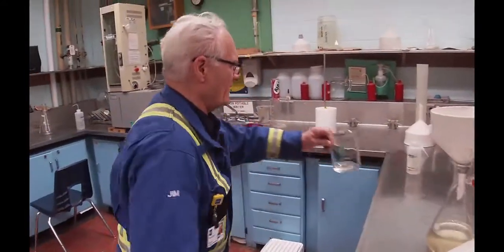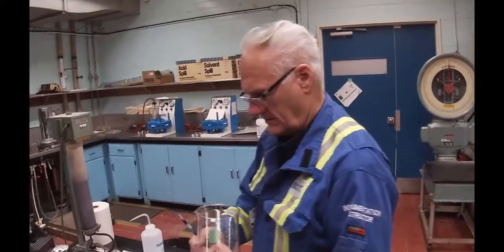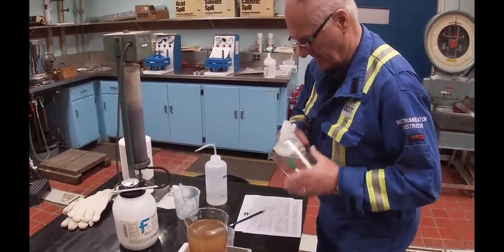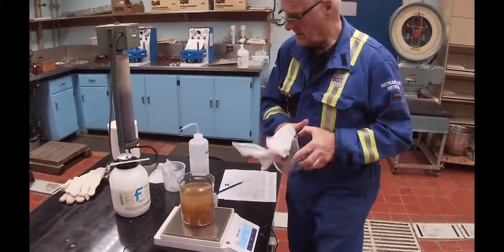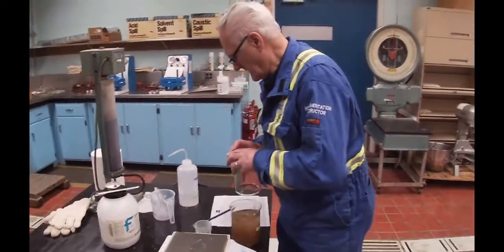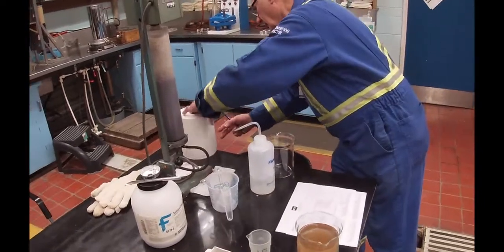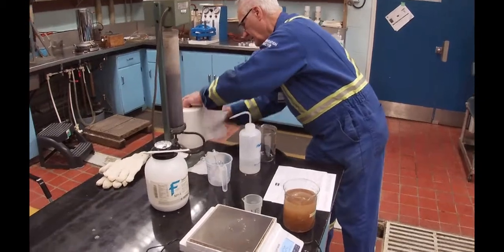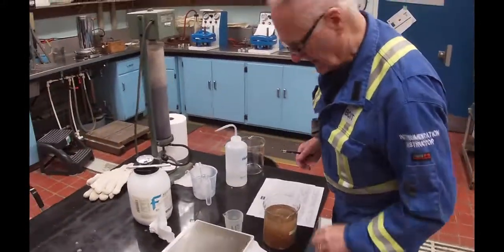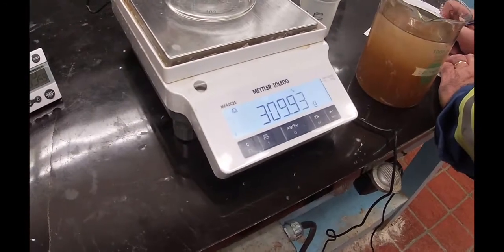Something I needed to do was to take this other beaker, weigh it — just the beaker. The beaker weight was 309.9 grams.